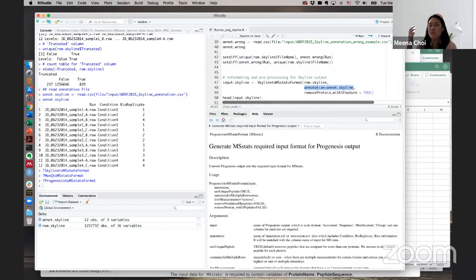Basically, how we handle it is, if we hear a lot of requests, we start to look at it and make our converter. A faster way is to look at our MSstats code, which is also available on GitHub. The converter tries to be very similar, so you can follow it and make a draft of your converter, and then we can confirm it. We definitely need more information about the data processing step, but if you really want to do this, you can also contact us.